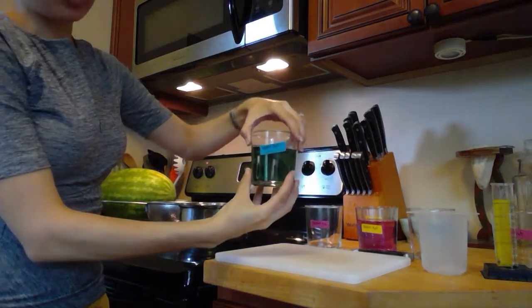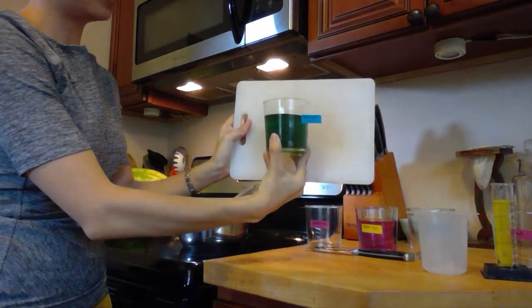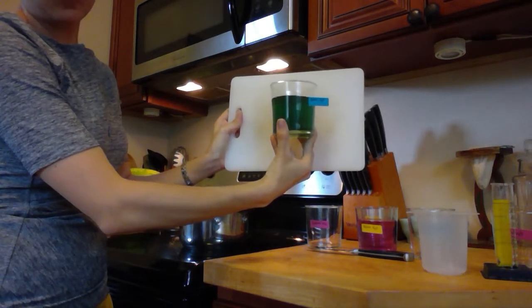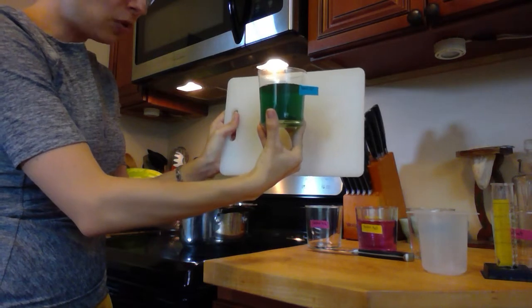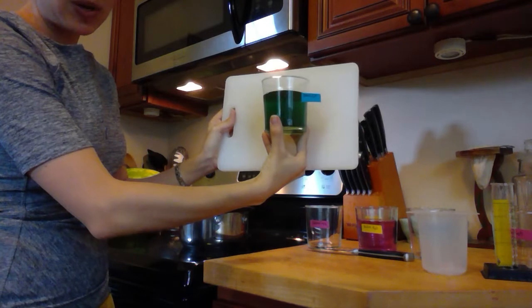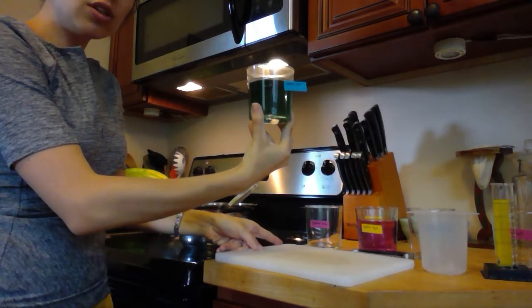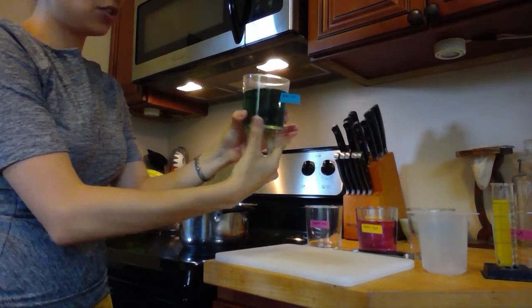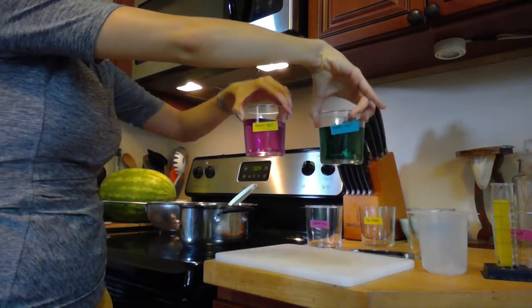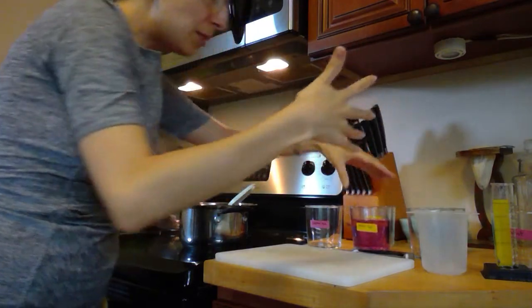So my basic water should have been basic. I'm going to hold it up to something white so that I can see. And this in person is actually quite a very pretty emerald green. So it looks a little bit different in my computer's camera, sorry. But it's a really pretty emerald green. So I would say that this definitely is basic, like we were expecting. And it looks pretty close to that 10 mark of pH. Nice pretty color. Side by side, they're certainly quite different. Okay, so I'll keep those there and we'll keep testing.